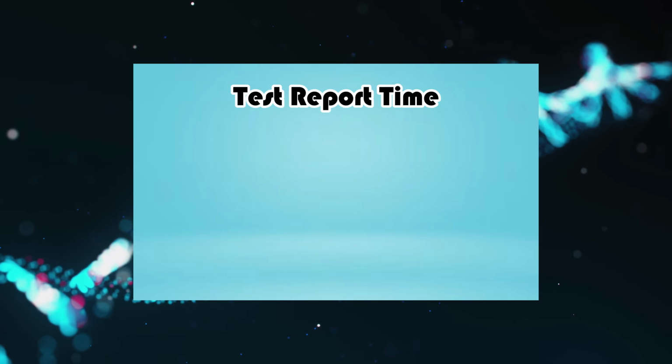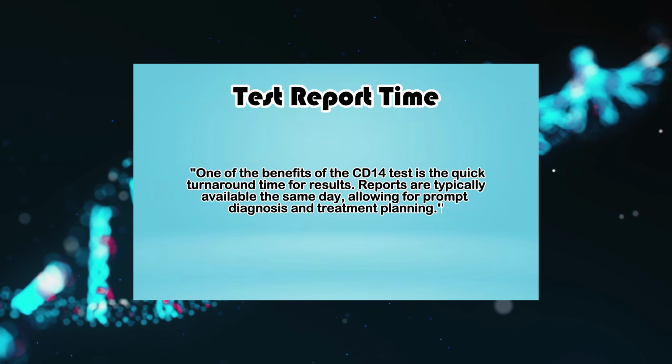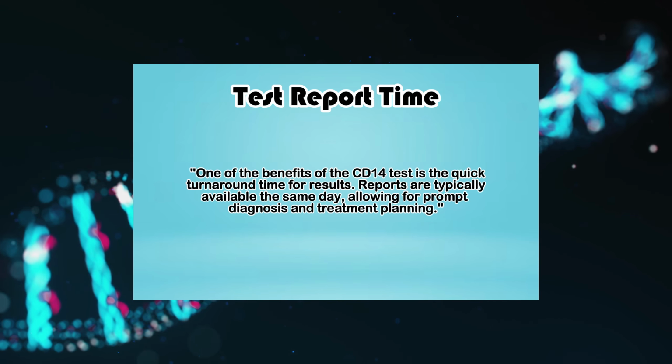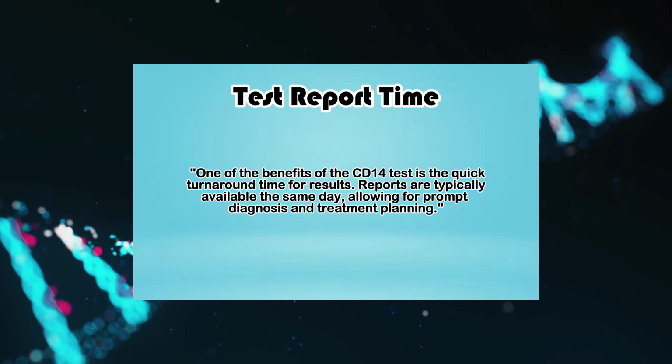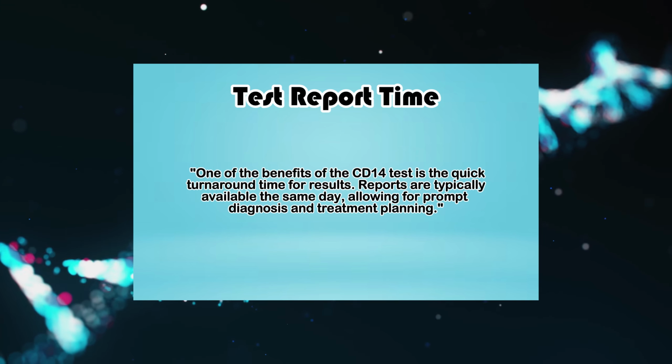Test report time. One of the benefits of the CD14 test is the quick turnaround time for results. Reports are typically available the same day, allowing for prompt diagnosis and treatment planning.